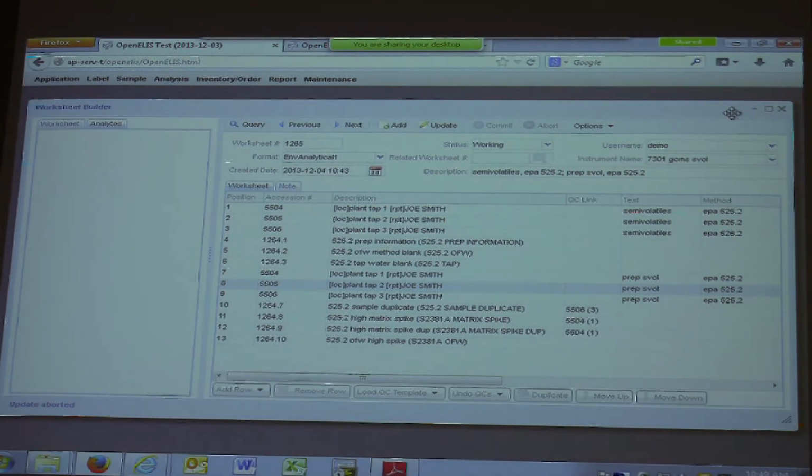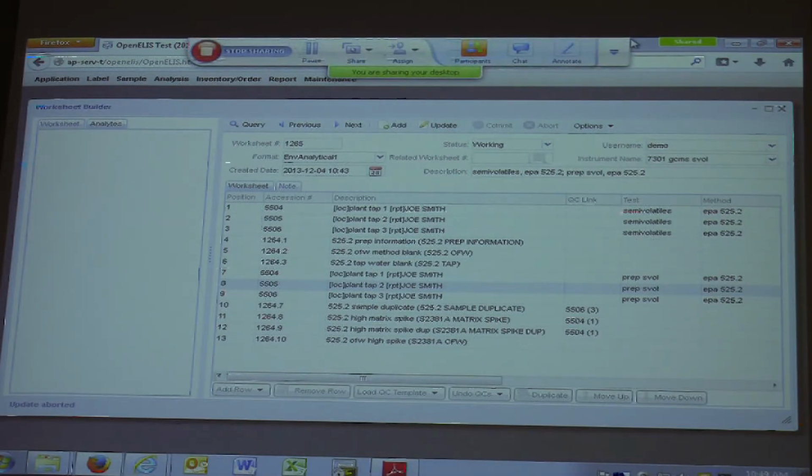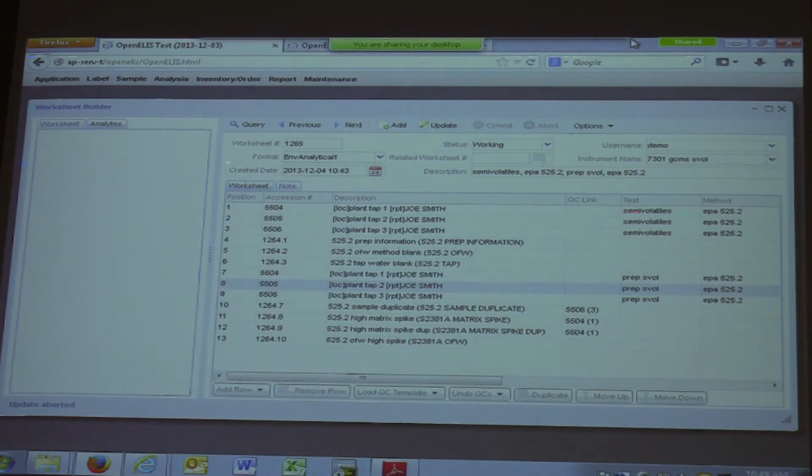So even if you put one just like it, that data is gone. If you move it up and down, that does not happen. So if you just move the row up and down, and it has data with it, that will carry. But if you were to delete the third row and insert one just like it, on the third row, that data is gone. Am I making sense to people?